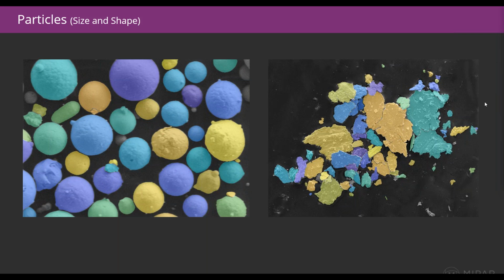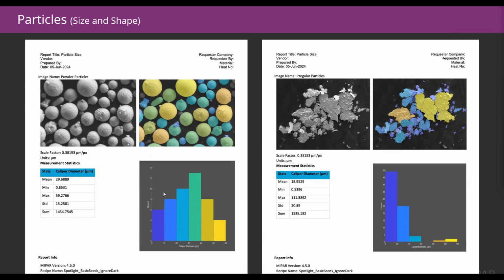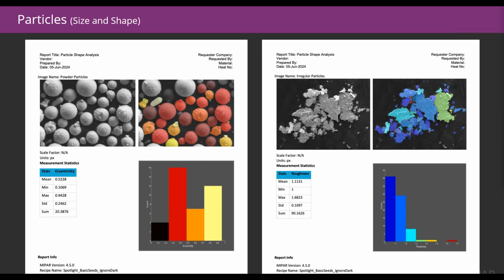In other examples where measurements were presented, like this next slide here, it's the same color map, the same color space, but now the features are color-coded on the basis of their size. So blue in this example would be very small particles down here in the 0 to 10 micron size range. Yellow would be up in the 50 to 60. So any place where you see colored particles accompanied by histograms, those are colored on the basis of size, or in this next example, shape.